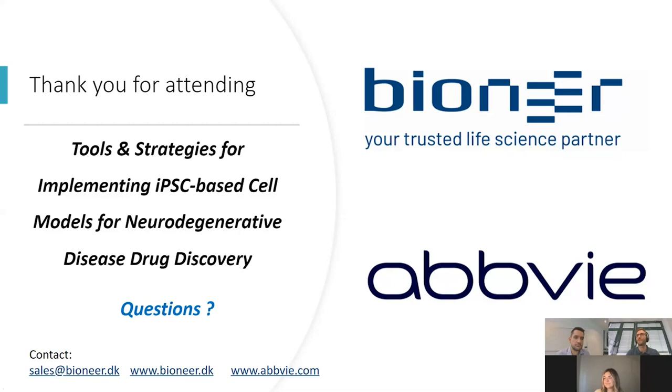Yeah, reproducibility is very important, and you cannot always guarantee it, but very simply said, on the one hand, of course, try to make your protocols as robust as possible. Also, don't prolong your differentiation longer than you would need to see an effect or observe what you want to observe. But at the same time, I think the biggest thing you can do from our point of view is to use large batches. So when you have these pre-differentiated cells, for example, these cortical neural progenitor cells or the pre-differentiated neurons with the NGN2 protocol, we normally aim at batches in the range of billions of cells, and really more than 100 vials of a stock of these cells, so that you can dedicate these to ongoing projects or repetitive experiments. And that normally works well if your protocols and SOPs are in place, so that you can expect a reproducible experience here.